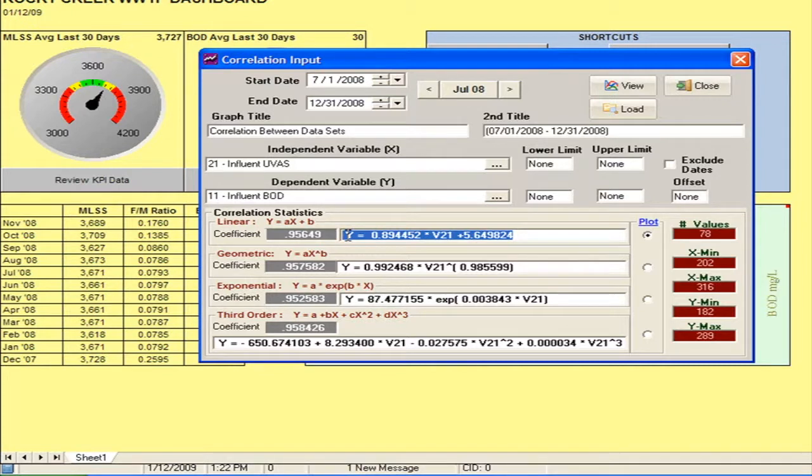So doing a pretty complex study of data is trivial in ops because all the data is already there. I just plot it in the graph, generate my equations, generate my coefficients of correlations, and I don't have to be a statistician to do this stuff. Just fill out the form and I'm off.